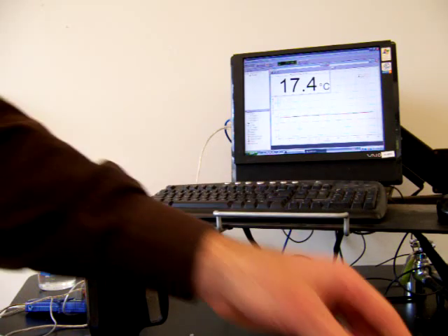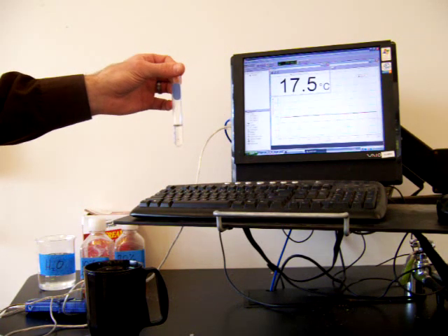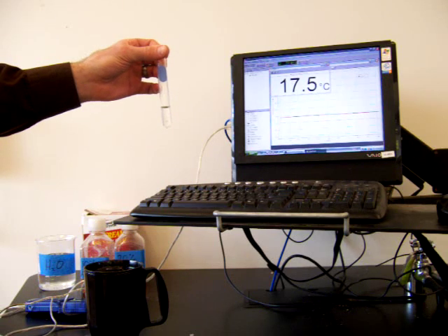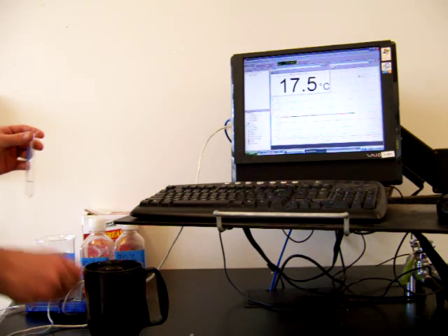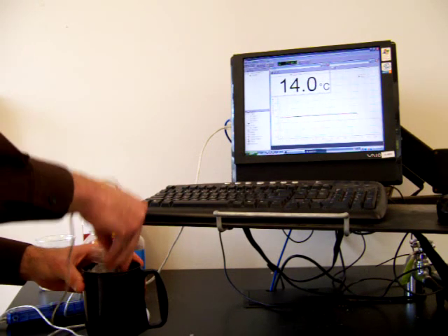To start out with, we're going to take our sample of water. So this test tube contains some distilled water. We want to find the freezing point of just plain distilled water. So we'll take a digital thermometer, put it in the test tube. We'll put the test tube into our ice bath.